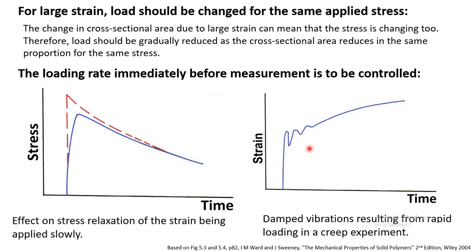So therefore, it is important that we understand and take care of the loading rate, because in most of the creep and stress relaxation discussion before, we have always used very idealized curves. But in reality, actually stress relaxation as well as creep are affected by the loading history prior to the measurement. So this is very important.